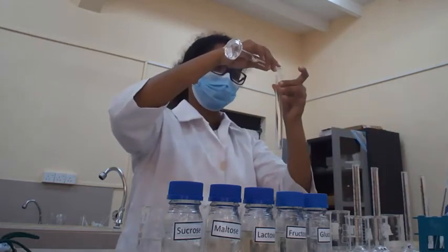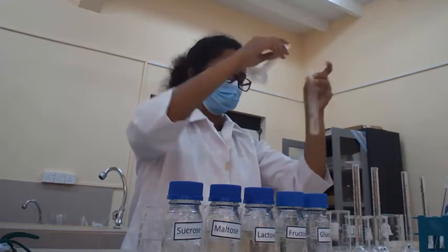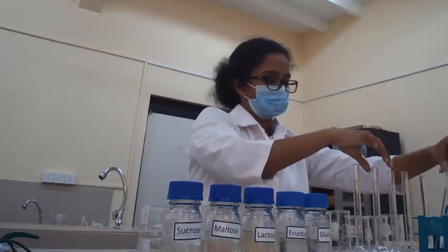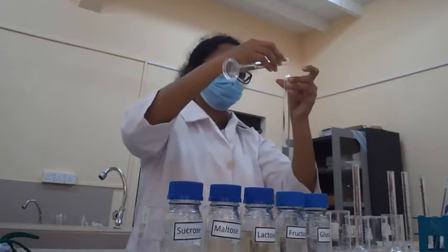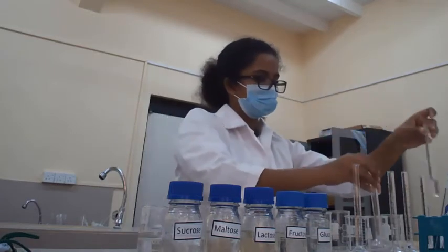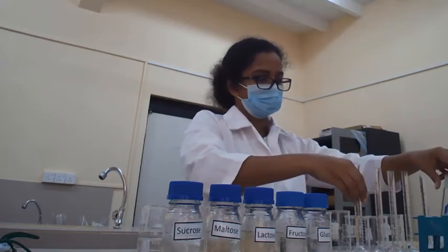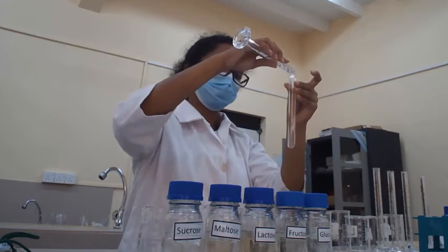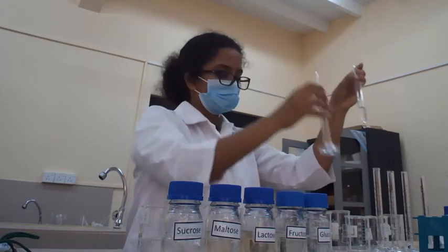Then lactose. Then maltose. Finally, we are going to add 5 milliliters of sucrose into the test tube.